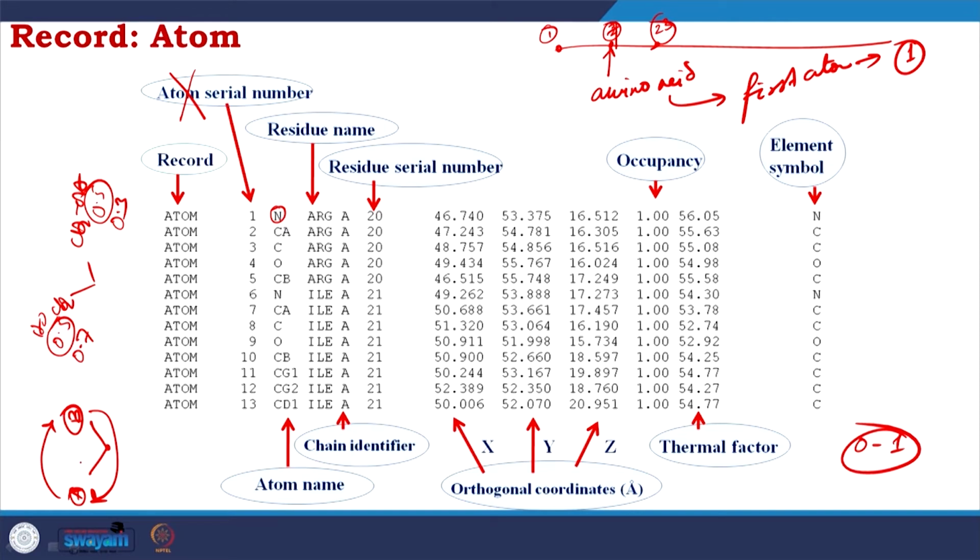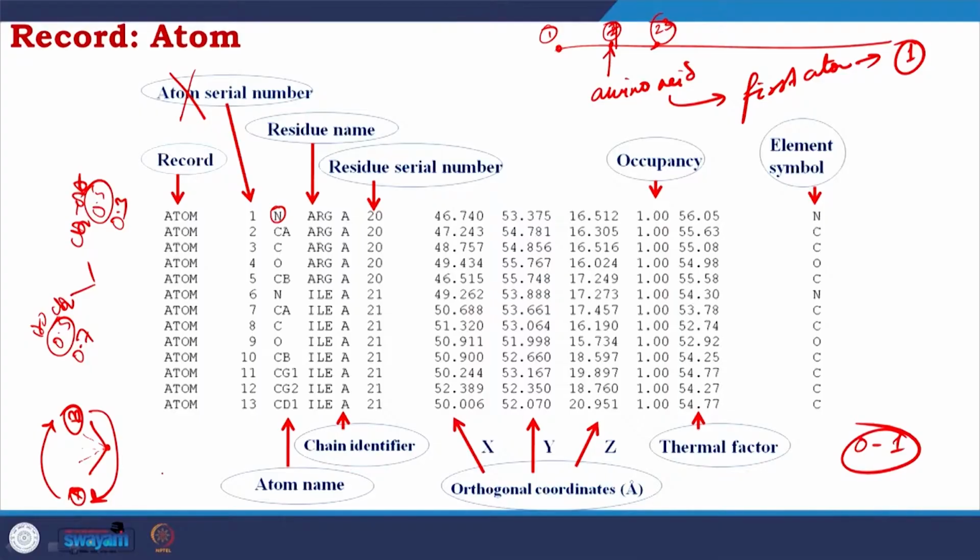So, you should have some intermediate conformations also, and that is perfectly true. So, why is it not there? Because the software measuring has a cutoff and it would not provide you the measure where the contribution is 0.1, 0.01 or something. There is a lowest cutoff.